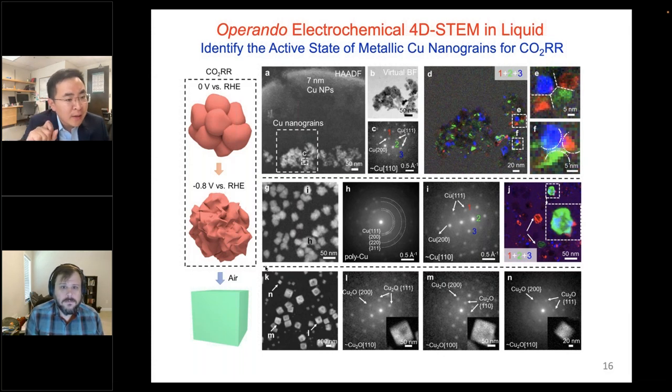Before we do any of those challenging in situ measurements, we want to know exactly where our starting point and our ending point are. So for every in situ measurement, we have already finished the ex situ measurement. It gives us a baseline understanding. This is basically the philosophy I have in mind. When we see a very bizarre phenomenon in the liquid cell TEM, we know we're not too far away from the benchtop measurement. If we do see something very different, which can also be an exciting observation, we make a close step-by-step comparison with the ex situ benchtop experiment. Also keep in mind that the very confined liquid cell may change the reaction kinetics and mass transport and make it very different from bulk analysis. This comparison gives us a constant calibration point of where we are for the in situ measurement.